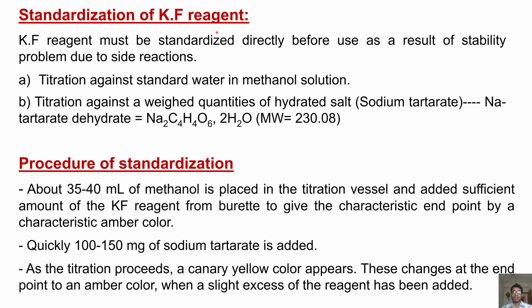So, standardization of KFR. KFR must be standardized strictly before use as a result of stability problems due to side reactions. Titration against standard water in methanol solution, then titration against weighed quantities of hydrated salt like sodium tartrate dihydrate. The procedure for standardization: about 35 to 40 ml of methanol is placed in the titration vessel and sufficient KFR is added from the burette to give the characteristic amber endpoint, and quickly 100 to 150 milligrams of sodium tartrate is added. As the titration proceeds, a canary yellow color appears.